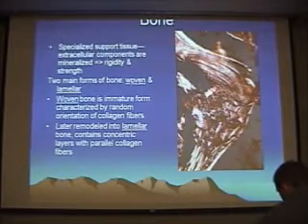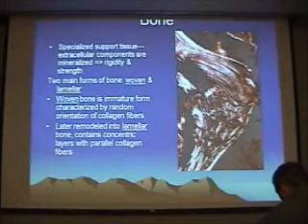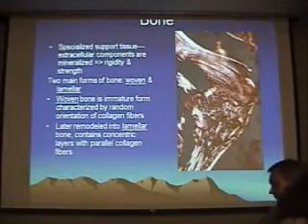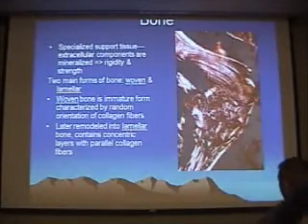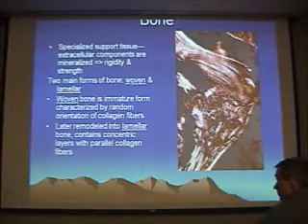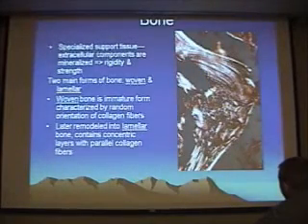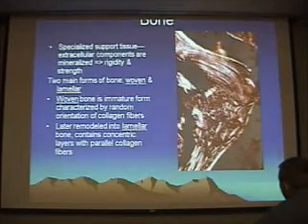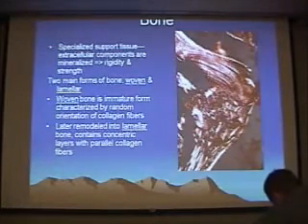Bone is essentially cartilage, hyaline cartilage, which has undergone further mineralization. So it has lots of mineral salt, hydroxyapatite deposited within it. Bone has a couple different varieties. So we have, for instance, woven and lamellar bone. Woven bone is the first bone which is produced, has very disorganized collagen.